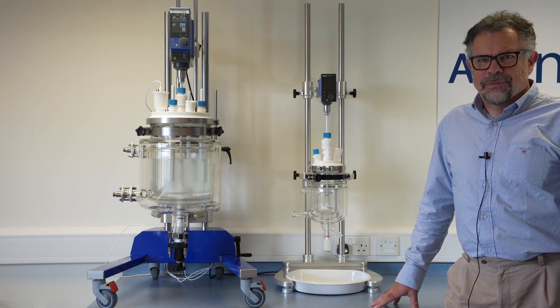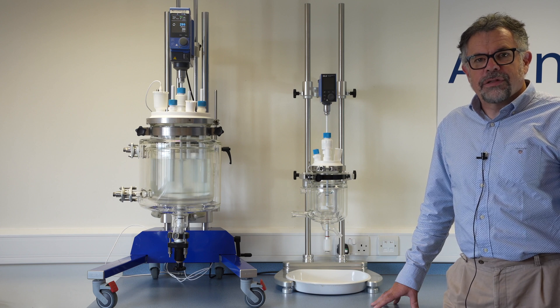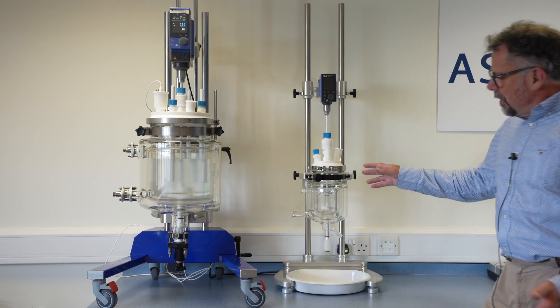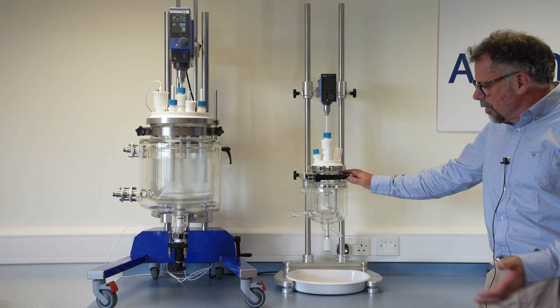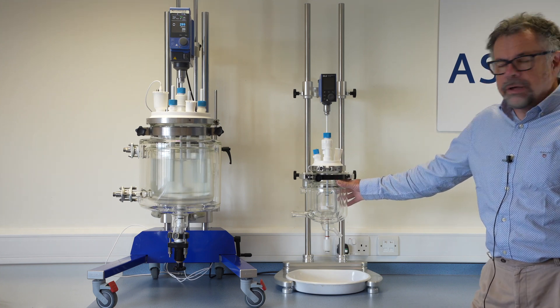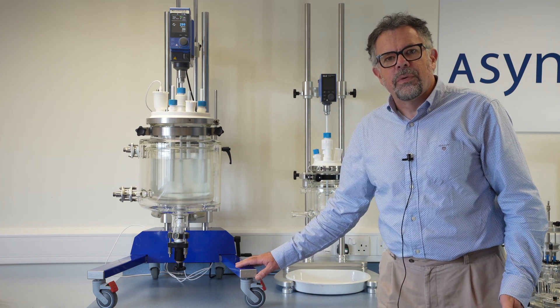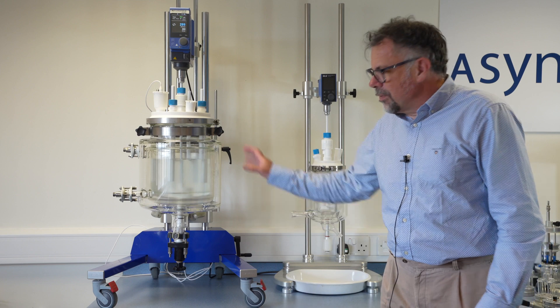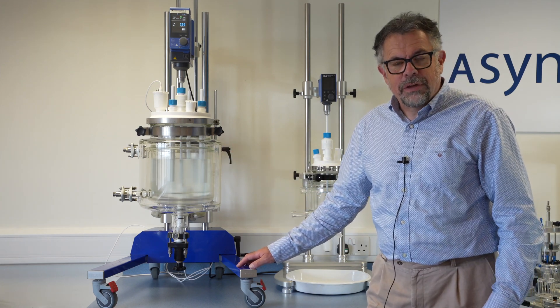Welcome to Asynt. My name is Martin Fordham and today I'd like to tell you about our ReactoMate Atom reactor system and support. Recently you may have seen my video on our ReactoMate Datum, which is a support system for reactor vessels up to five liter volume. Atom goes a bit further — it is suitable for reactor vessels up to 30 liters, jacketed reactor vessels.